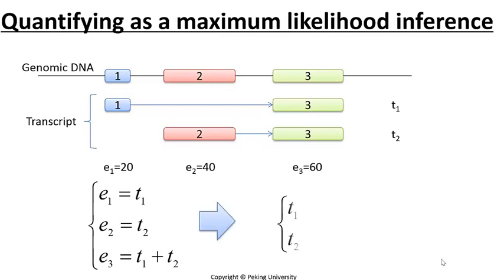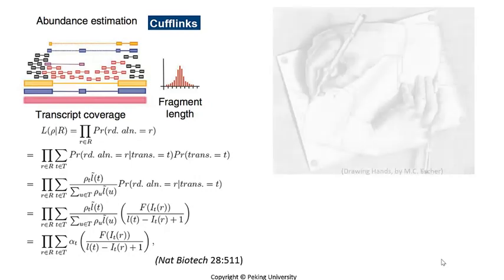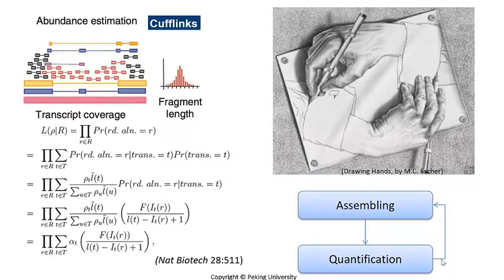Of course, this problem becomes more complicated in practice, as we consider the fact that the transcript assembly algorithm determines the nature of read distribution. For example, in Cufflinks, the reads are distributed with respect to other factors, such as length distribution. In fact, transcript assembly and expression level estimation are often done by EM and other iterative algorithms to more accurately estimate the expression levels.